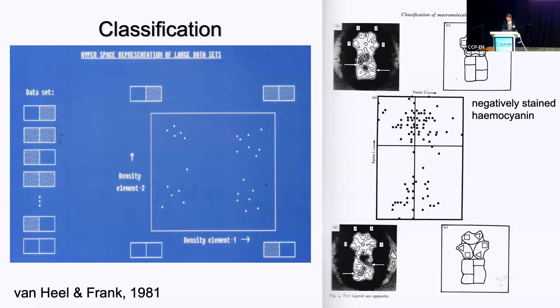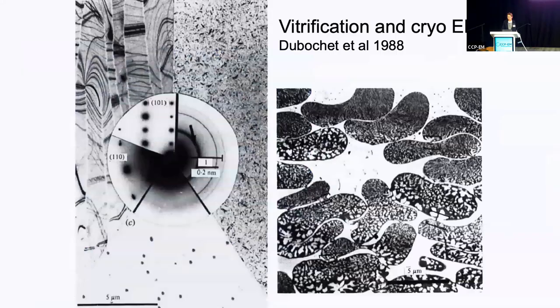Anyway, the other thing that was really important was vitrification. Purple membrane is this very unique stuff, this 2D crystal. It's like concrete. You could just take those sheets of membrane and put them in a high vacuum and they wouldn't disintegrate. That's the only biological object practically I know of where you could just put it in a vacuum and it's fine. Of course, everything else has lots of water. And Jacques Dubochet showed that if you plunge things into a proper cryogen like liquid ethane, you could get the water into a non-crystalline state, to vitrify and not have ice crystals.